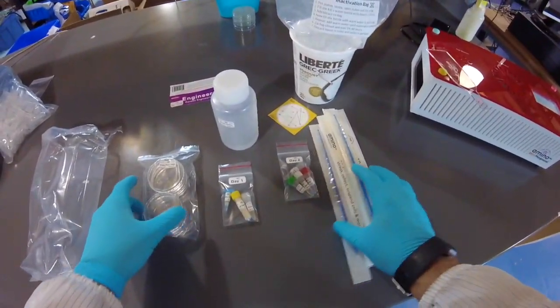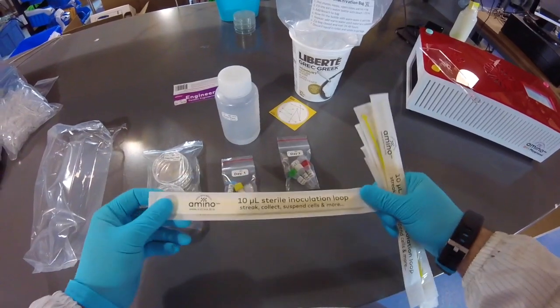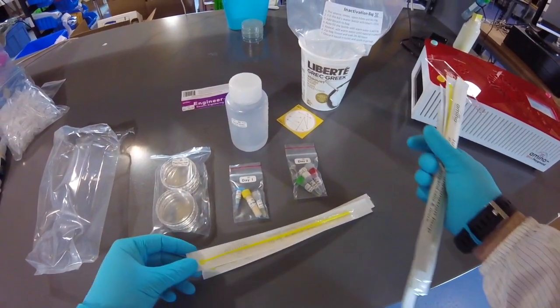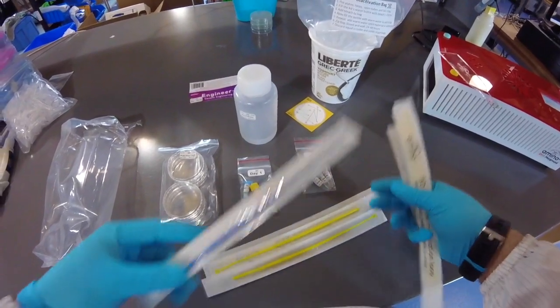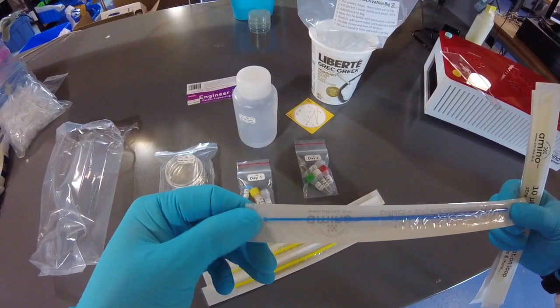Okay, so these are loops, inoculation loops. We've got a couple of different sizes. We've got some 10 microliter yellow loops. You can see they've got a little loop at the end. That loop can hold 10 microliters of liquid. And we also have these blue loops, which are much smaller. They can hold about 1 microliter.